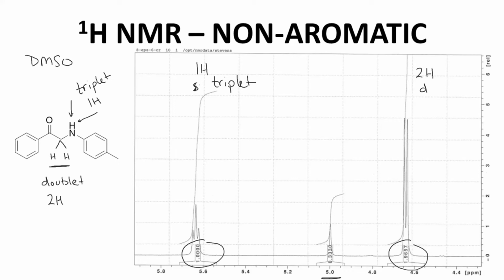So that's great. And of course we have this troubling impurity peak on here, which we're going to skip, but we can't ignore it. It's raising its hand, making itself known. But this is an interesting thing in DMSO. When you run spectra in DMSO, you will often be able to see coupling interactions between your NHs and OHs. In other solvents, the most common other solvent is CDCl3, you typically don't observe this type of coupling interaction between OHs and NHs.